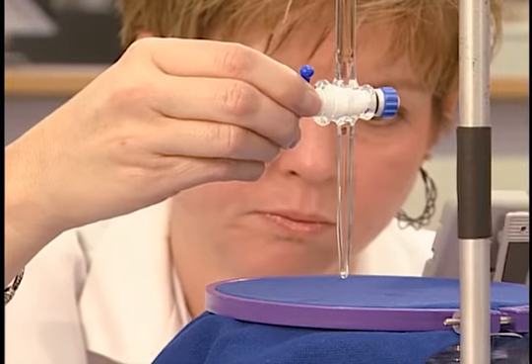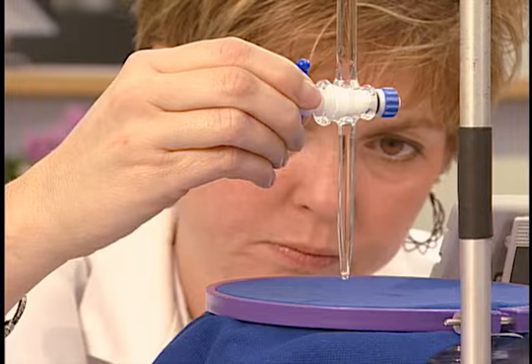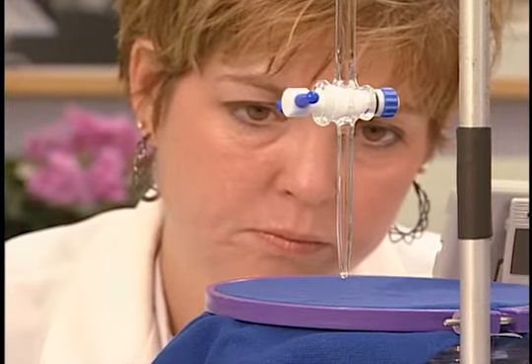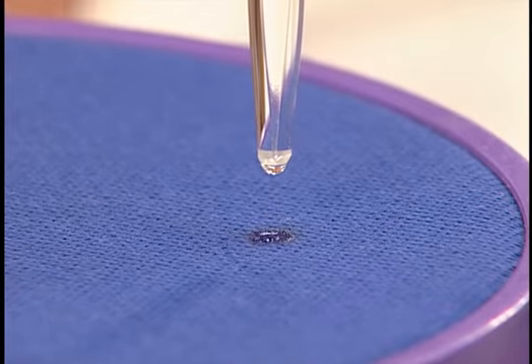Water drops on fabrics that have high absorbency may disappear so quickly that an operator cannot start a stopwatch fast enough to begin timing. The longer a water drop shows a reflection, the less absorbent it is.